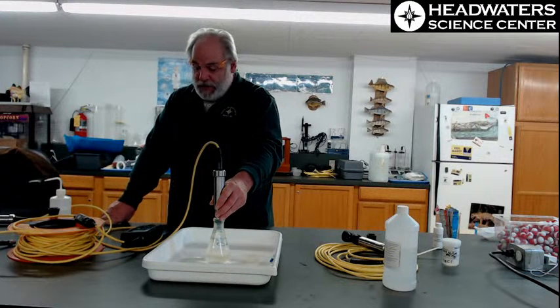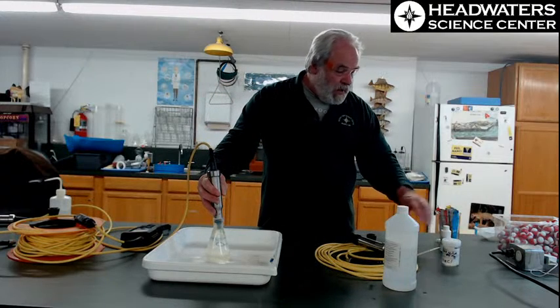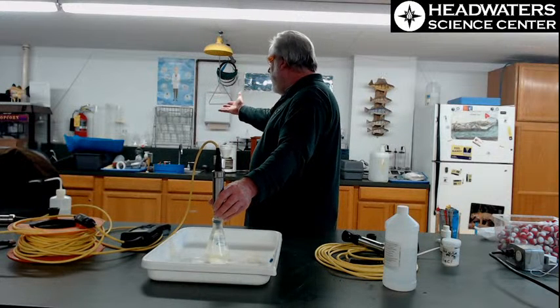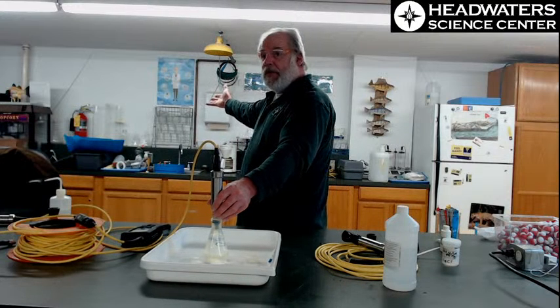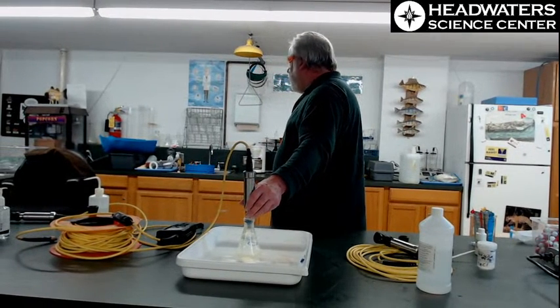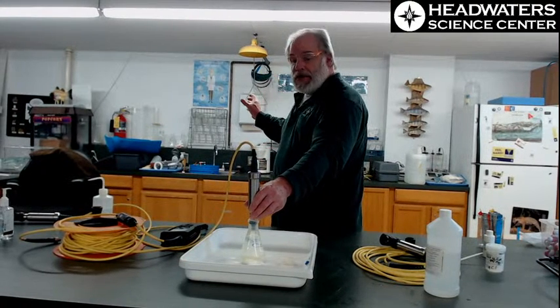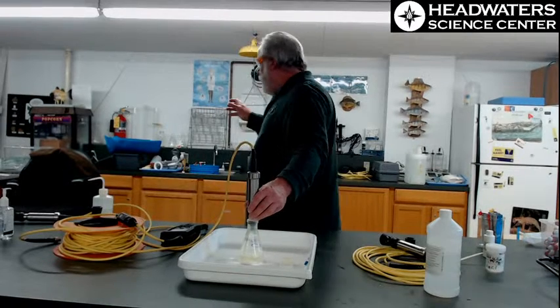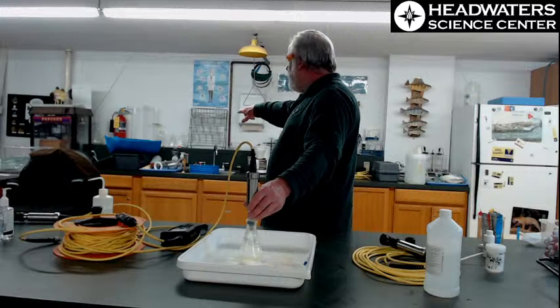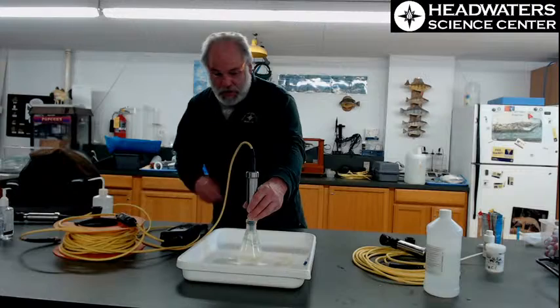It's being stubborn on the calibration, but it's going to give us a good reading when it does. Meanwhile, let's double down on what else we can do. I've just cleaned out the sampler. It's over there. Maybe you can point over to that. I have to use a super soapy solution, assembly line, food assembly line quality, to make sure that the samplers themselves don't leave their mark on the data, on the water samples. Perhaps on the one we do this Friday, we'll show you how those work out in the field.